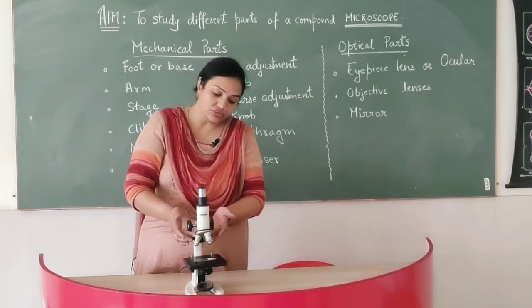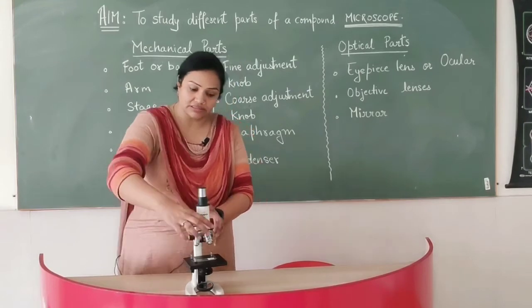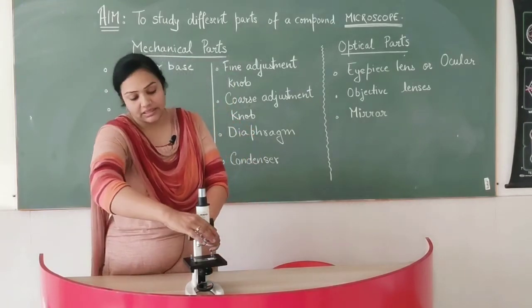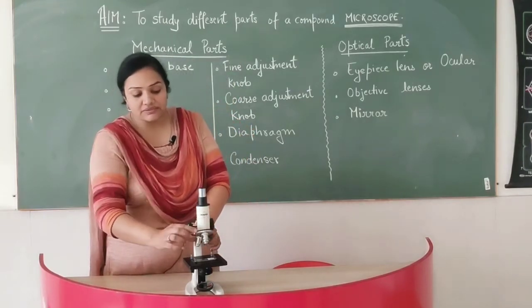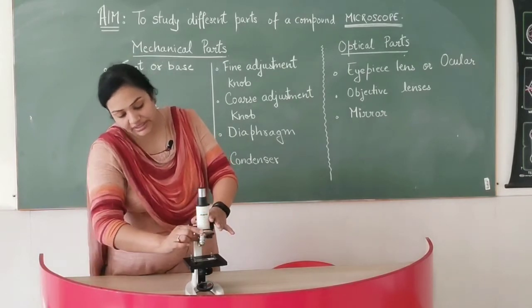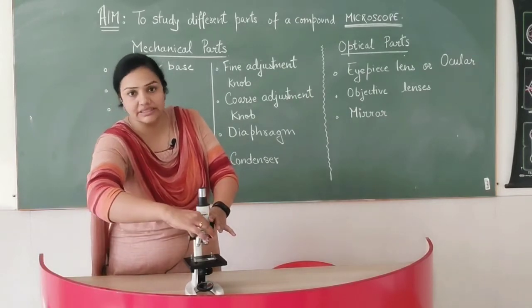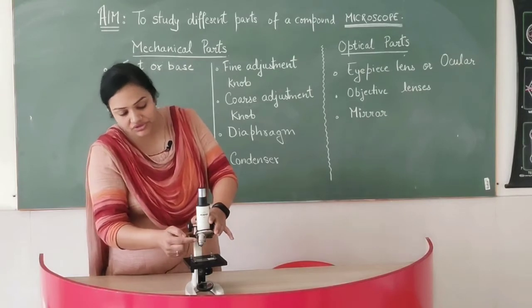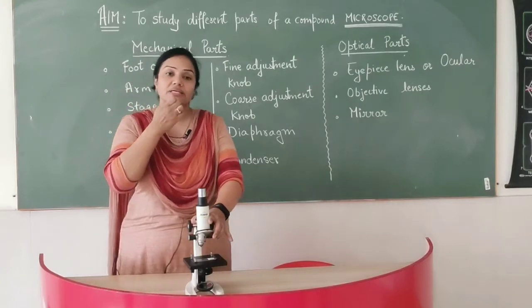Now coming to this part. This is called the nose piece, which is a rotatory disc. It can easily rotate. It is having three points where you can put three lenses.